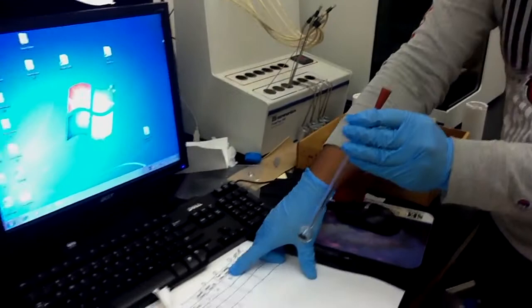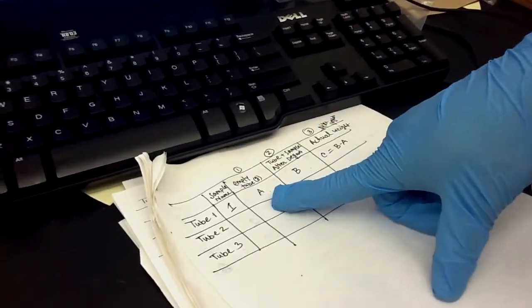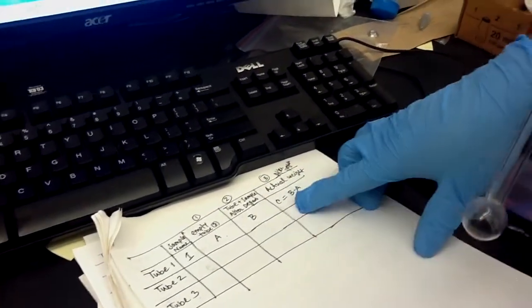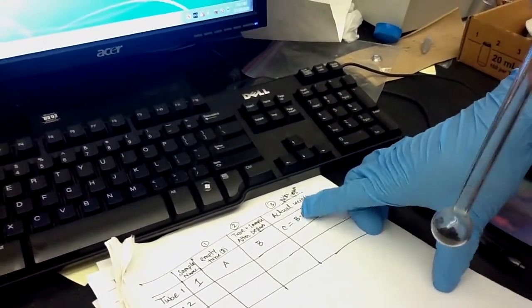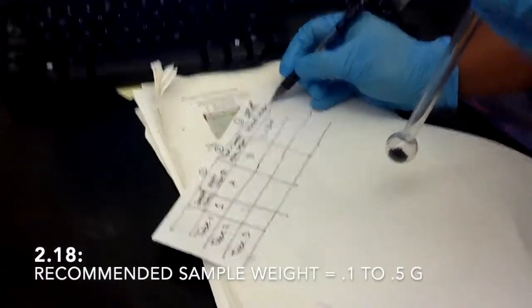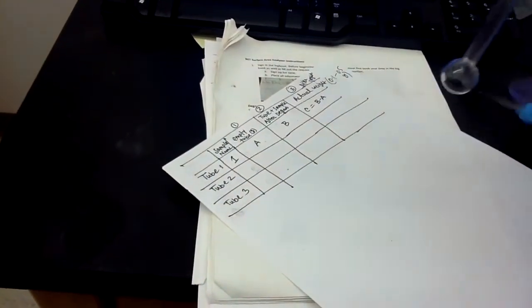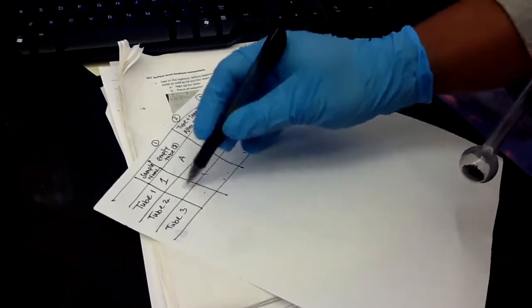This is B. Previously you had the empty tube weight A. After degassing the sample, you got B. So the actual weight will be C, where C equals B minus A. This is the actual weight, and the recommended actual weight is 0.1 to 0.5 gram of sample. For tube 2 and tube 3, use the same method: measure the weight of the sample.